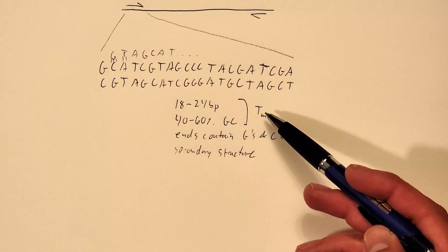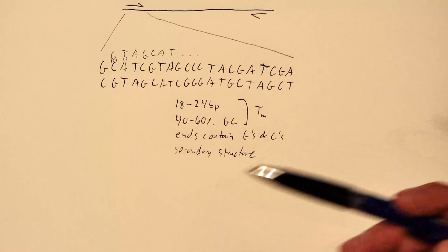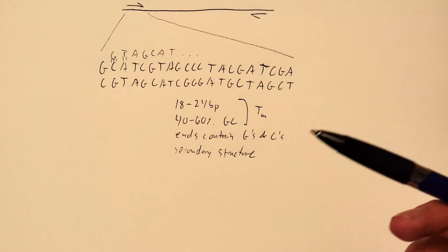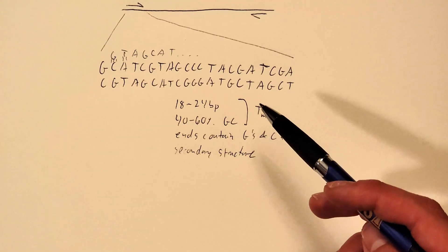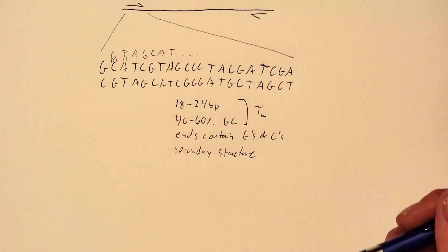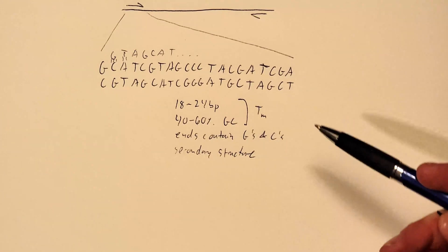So again there are ways to calculate TM by hand but I would highly recommend using your polymerase manufacturer website to find the melting temperature of all of your primer pairs. So that's enough theory let's go to the computer and actually design some primers.